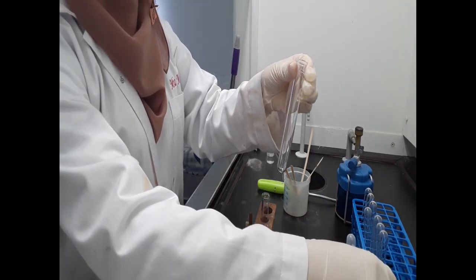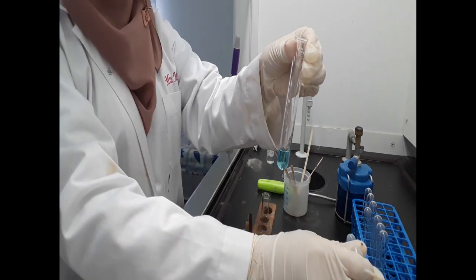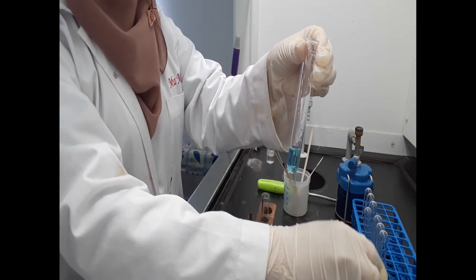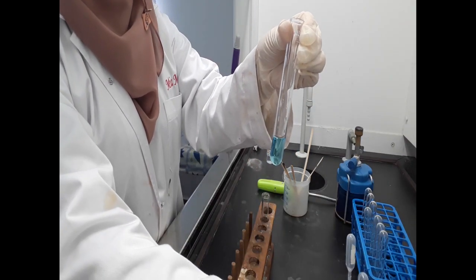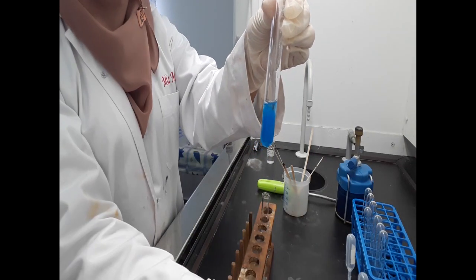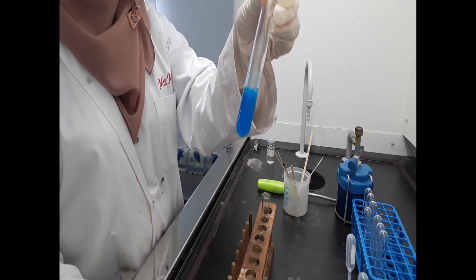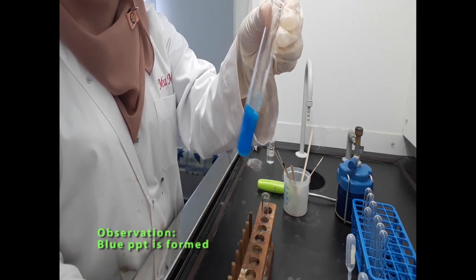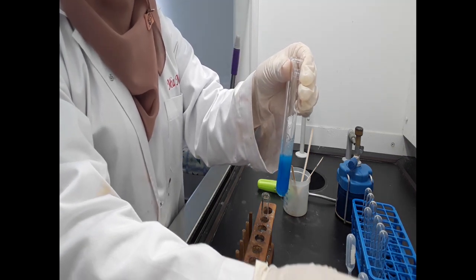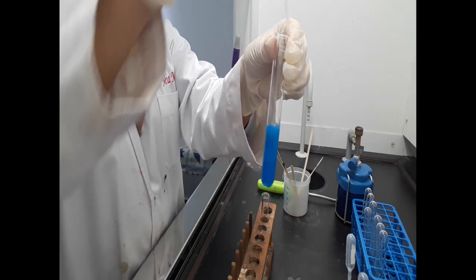Same thing, 2 cm cube of solution S. Add aqueous sodium hydroxide. Blue precipitate is seen. And then add excess sodium hydroxide.